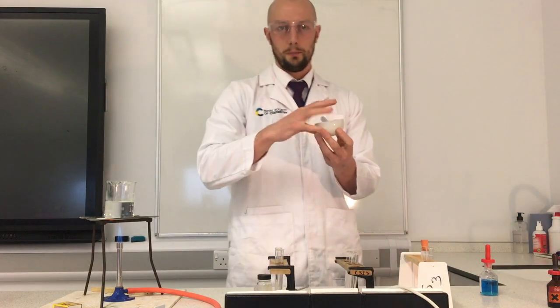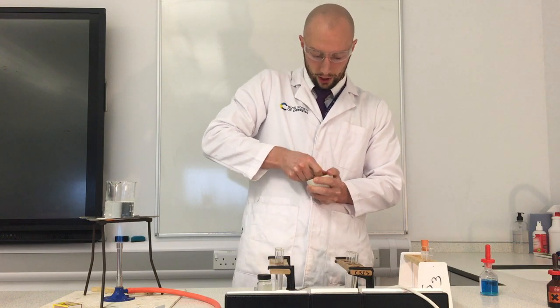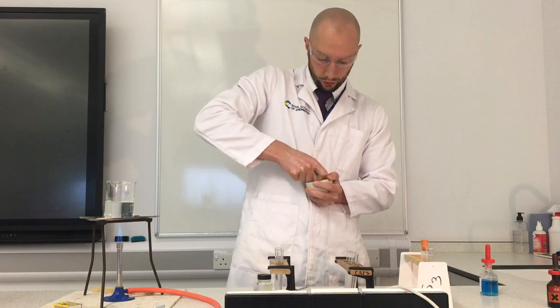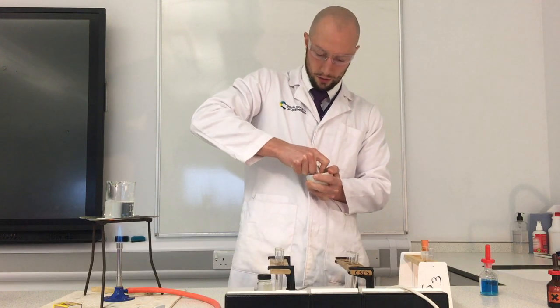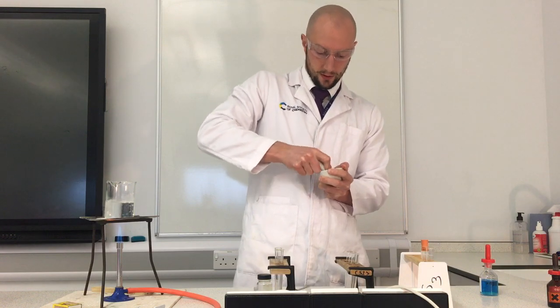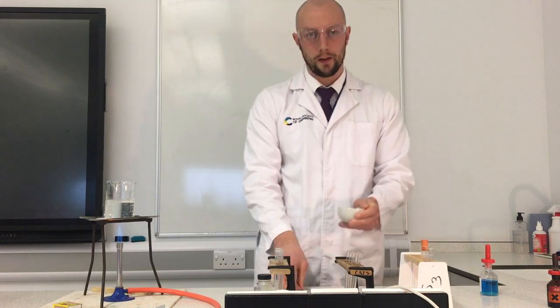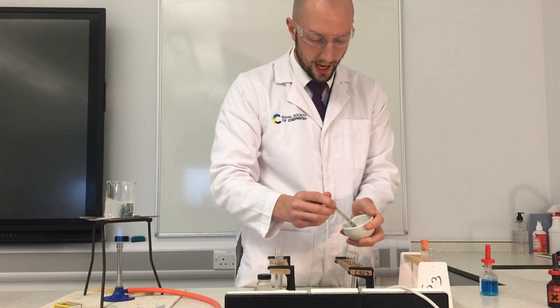First, I've got some in my pestle and mortar, and I'm going to crush them up to make a nice fine powder. Good crushing the rice cake. It's a satisfying sound. I do enjoy this practical science. Okay, I think that's crushed up enough. I'll take my spatula and I'm going to put a little bit into each of 3 test tubes.